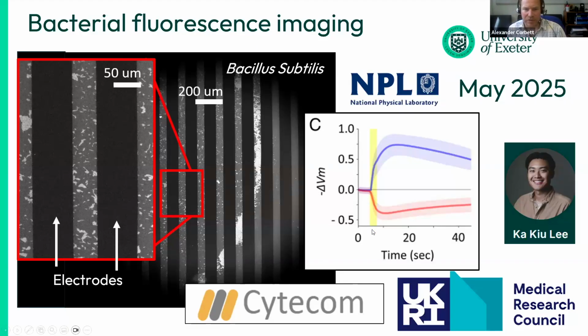They provide an electrical stimulation through the electrodes, and if the cells are alive and healthy, we see an increase in this fluorescent signal, and if they are not, then we see a decrease. And so the question was whether we could have the level of sensitivity to extract that.